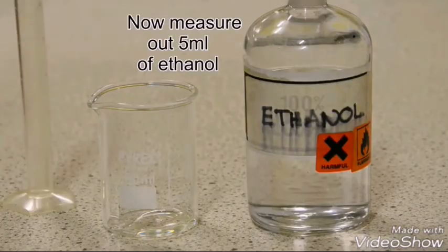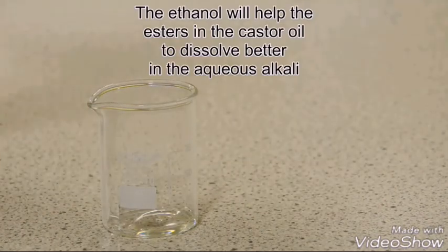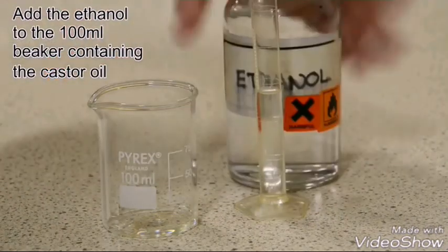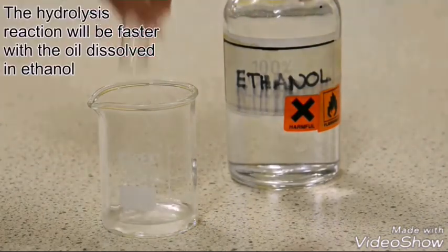To that, I'm going to add 5 mils of ethanol to help the castor oil to dissolve better, because you know oil and water don't mix, and the alkaline solution I'm going to be adding later on is essentially water. So this ethanol is going to help the castor oil to dissolve.